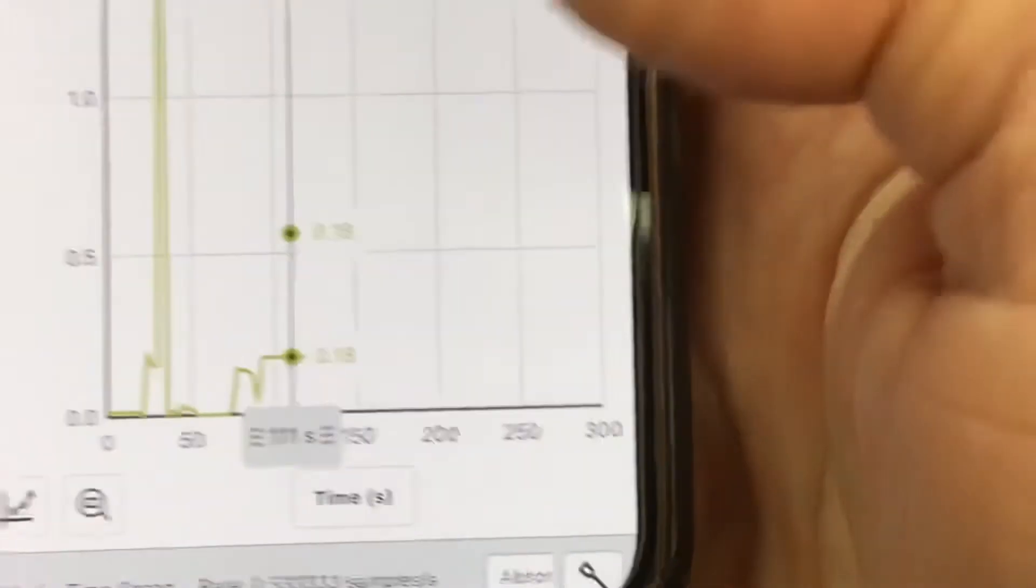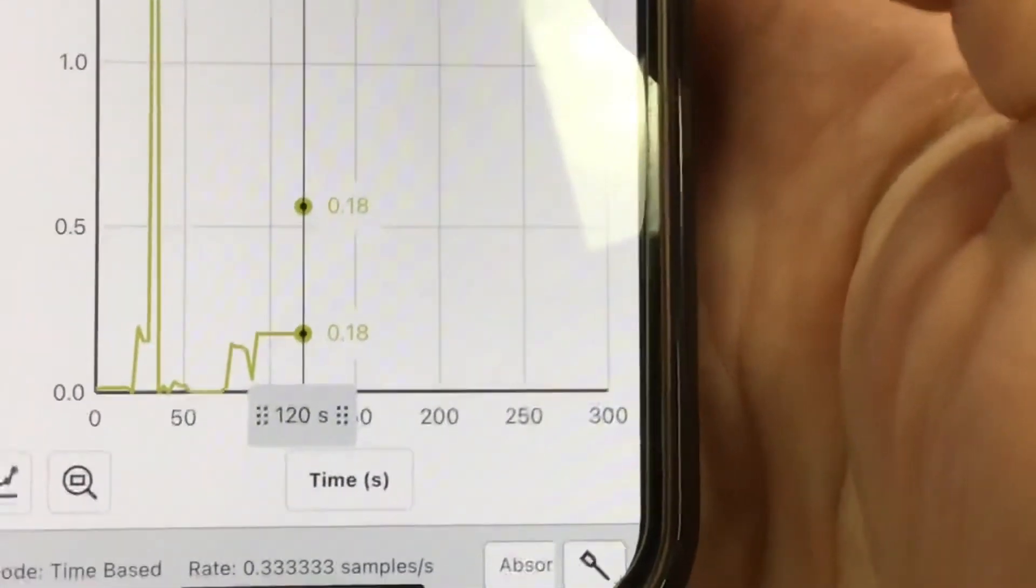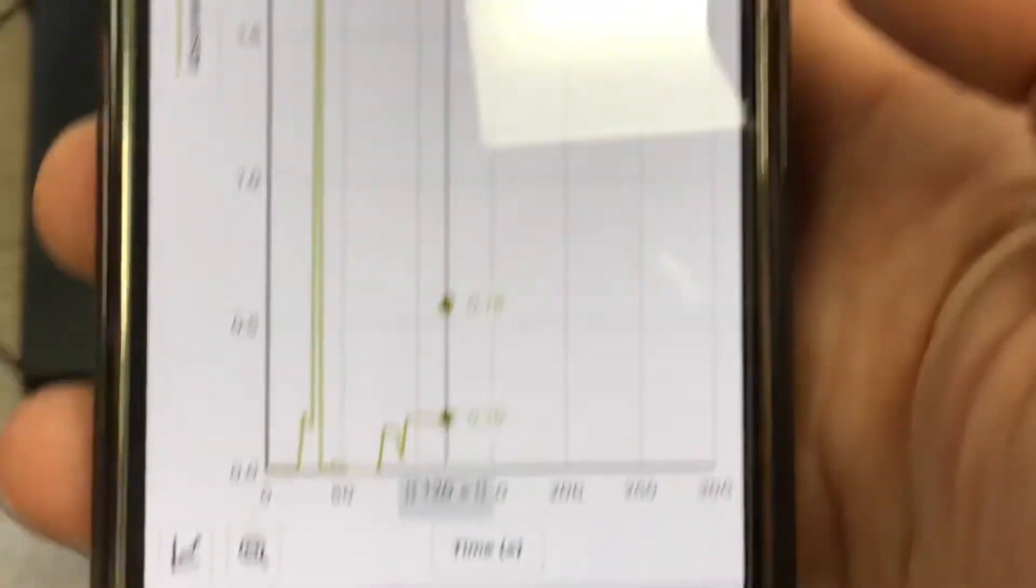And it shouldn't change over time. Right. The reaction's already at equilibrium. Yes. So we're good. Let me take 0.18 for trial one.